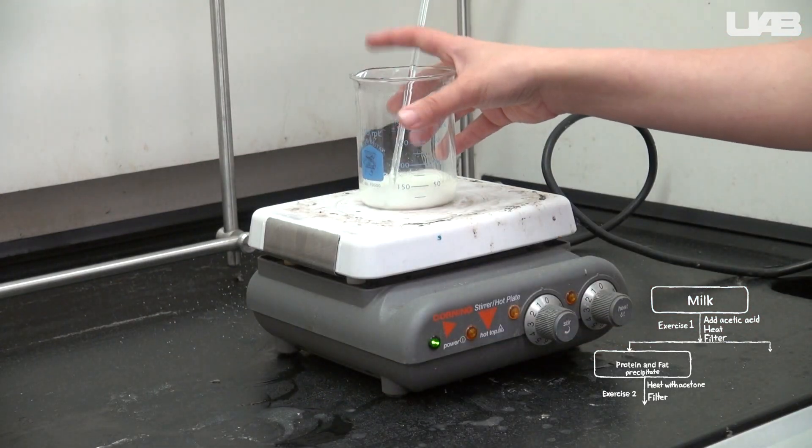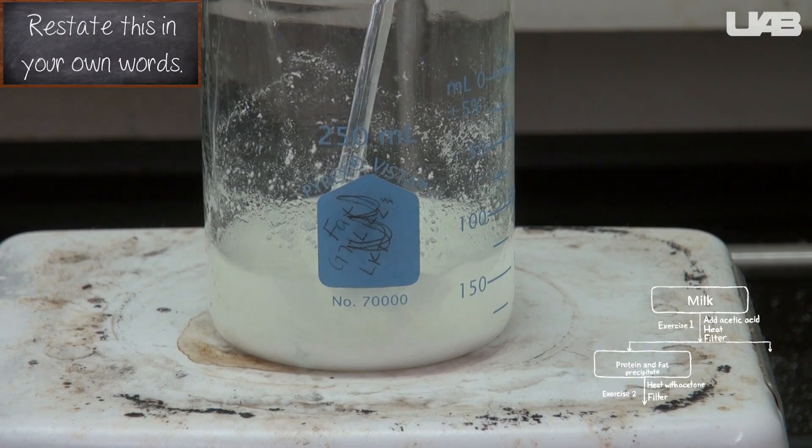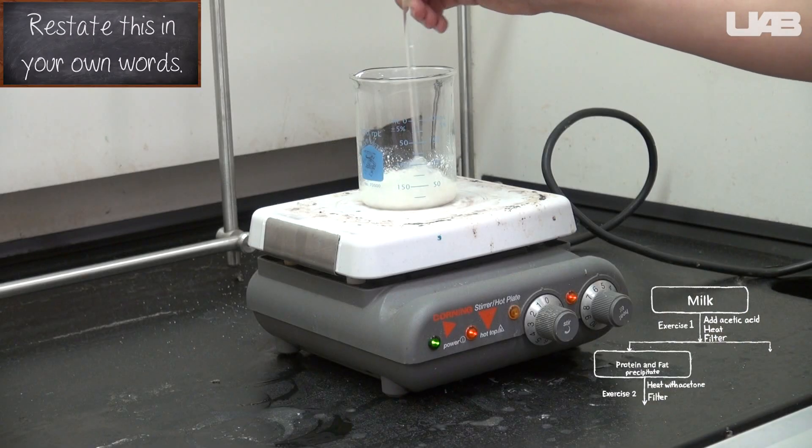Place the beaker on the hot plate, turn it to low heat around two or three, and stir quickly to prevent bumping, which could cause the solution to splash out of the beaker and potentially burn someone.